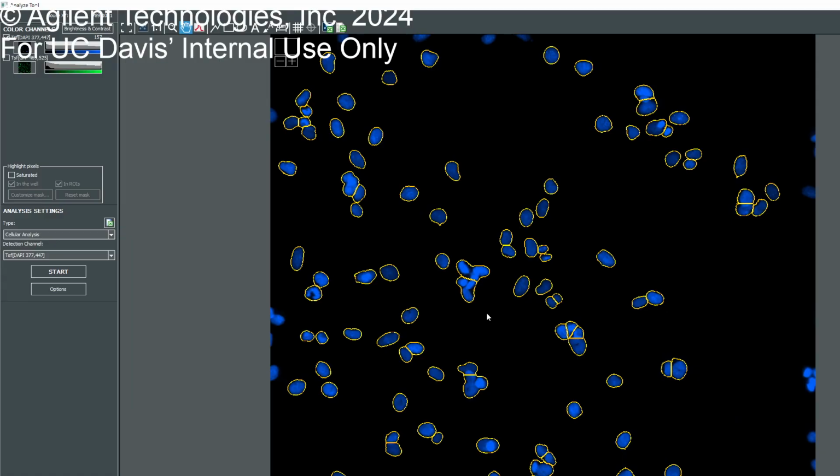So imagine this was your 5,000 threshold. If you're just sitting on the bottom and looking at the mountain peak from the water level, you're not going to see two peaks because your water level is at 5,000. That's your threshold boundary. If you set it where we set it, like 10,000 or 12,000, now you are basically distinguishing between these two peaks because of the water level.